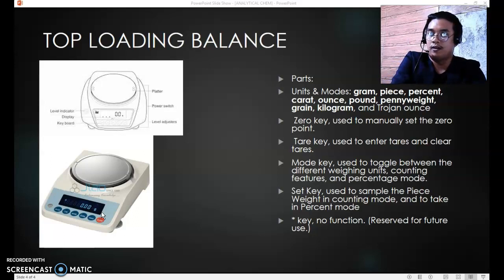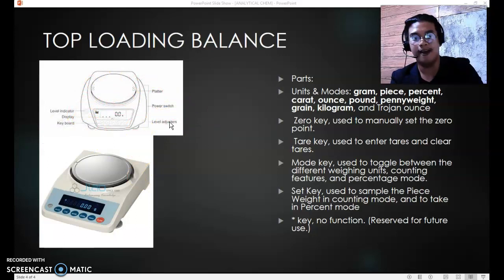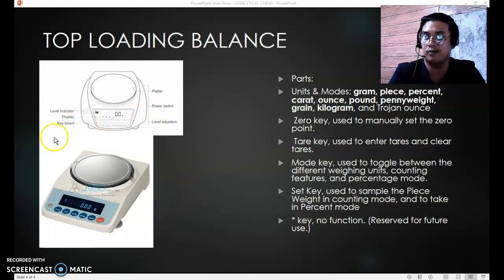And at the upper part, it shows what the top loading balance parts are. It has a platter here, the power switch located near here, a level adjuster here, level indicator, buttons here, and display. There's the screen and keyboard where the power switch and the keys are located.